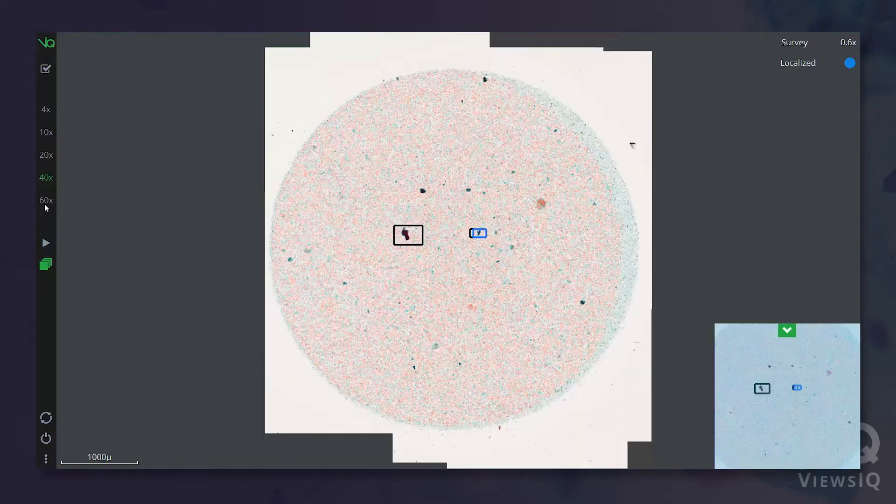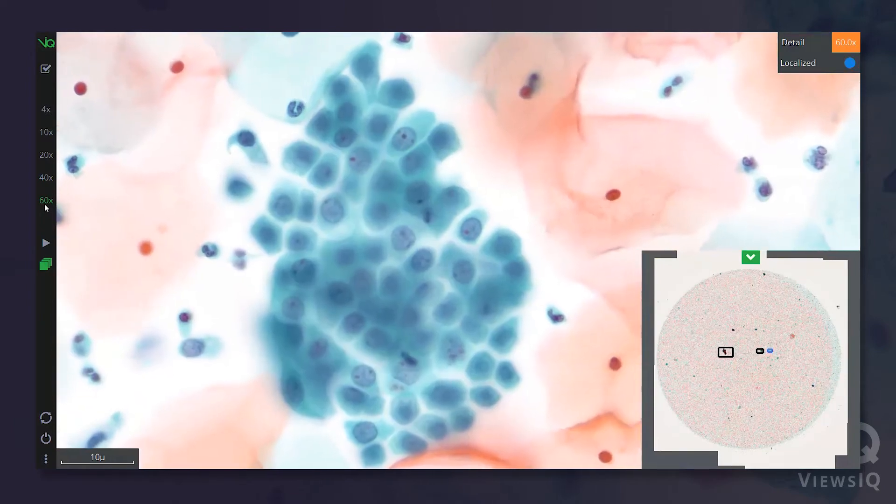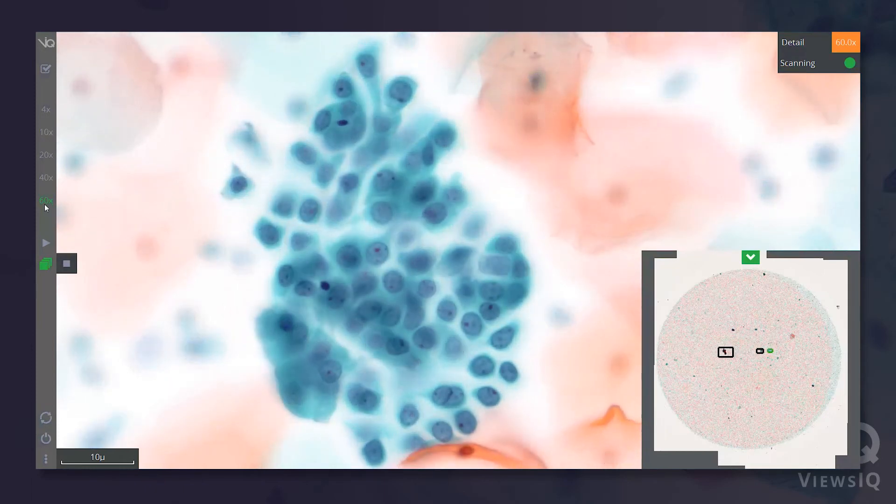Select volume recording and then simply start and stop recording as you move up or down through the sample. To record another region or 3D volume, just move to that region and record. Here we record a second 3D volume at a 60 times magnification.